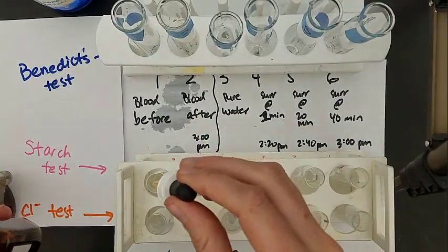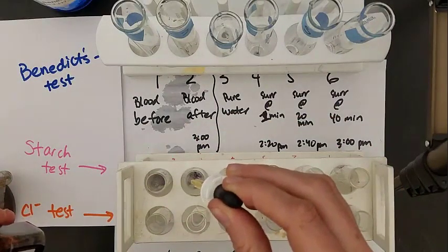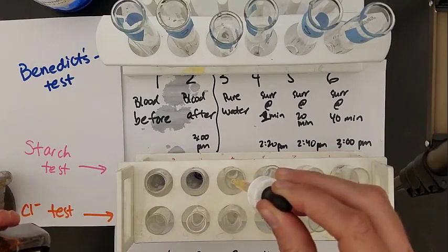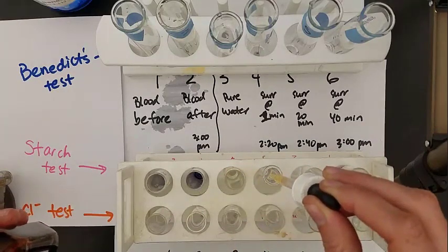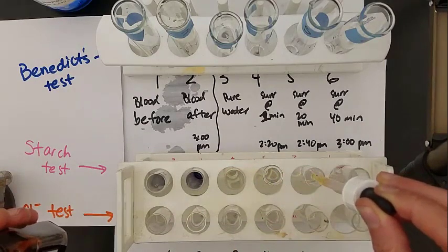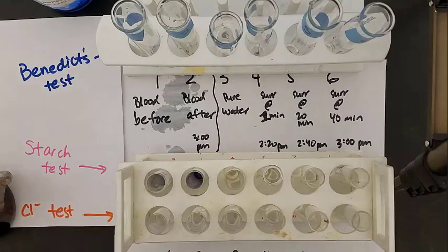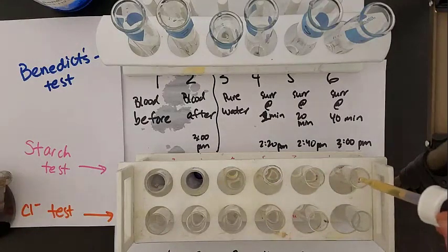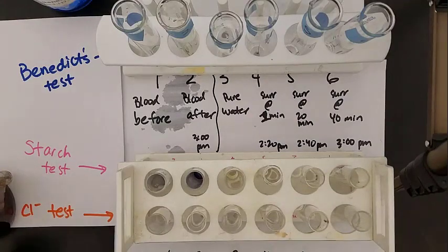The iodine test is for starch, and it will turn purple if starch is present. You can see that the first two, the blood samples, both turn purple, so there must be starch in there. We'll take a closer look in a second.